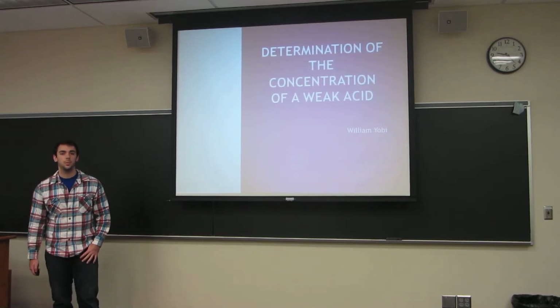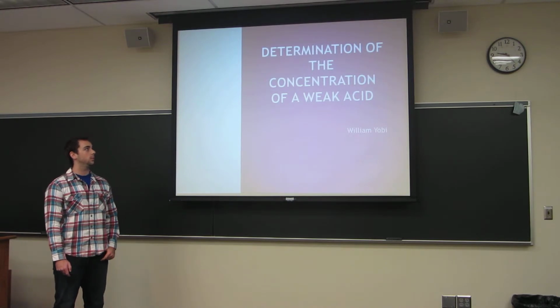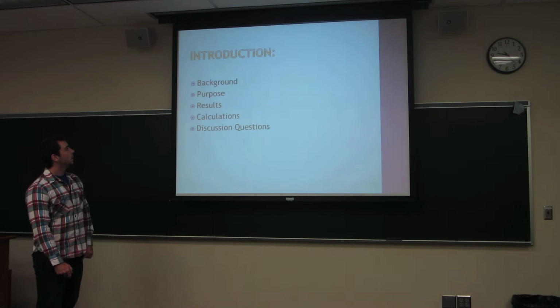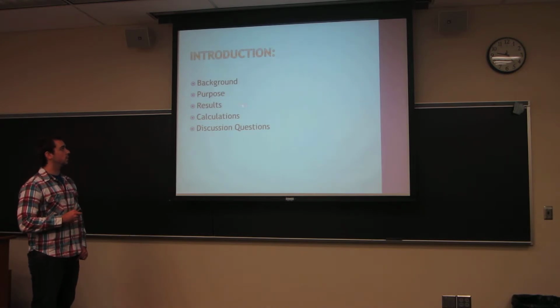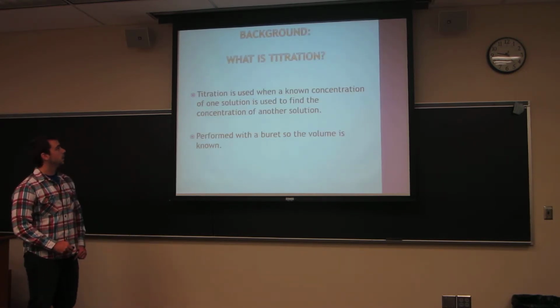Good morning, I'm Will Yobi, and I'm here to explain how to find a determination of the concentration of a weak acid as we did in experiment number 7. Today I'll be talking about the background of titration, the purpose of the experiment, the results of our experiment, calculations, and the discussion questions at the end.